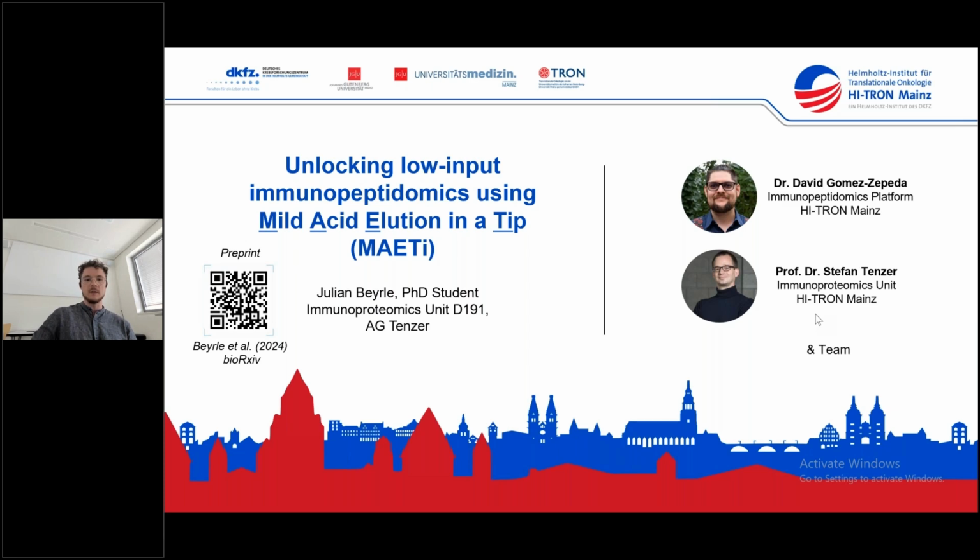The introduction and also the opportunity to present our research here today. And the topic of my talk today is unlocking low input immunopeptidomics using mild acid elution in a tip.